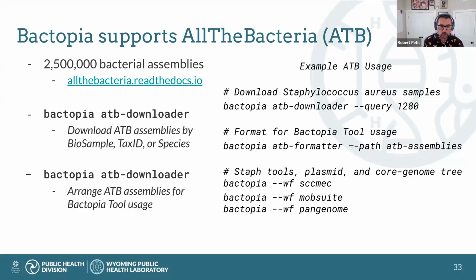And then you could say, I want all the samples that are within a certain distance from the sample I'm interested in, and then build a tree based on that, just so you can get an idea of how your sample compares to other samples. So there are ways to reduce the amount of data and zero in on what you're interested in with these Bactopia tools. One example that we used was we were interested in a particular Bacillus species, and we did the whole genus and then zoomed in on the species we were interested in.